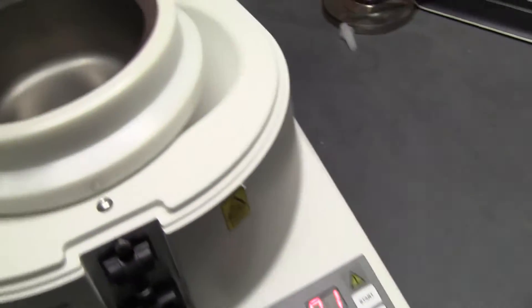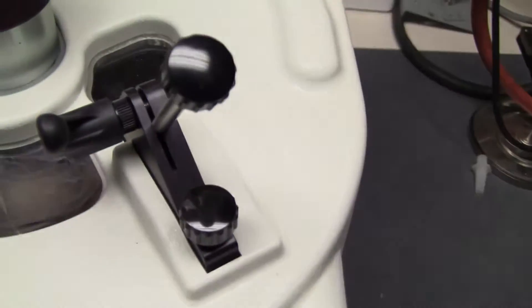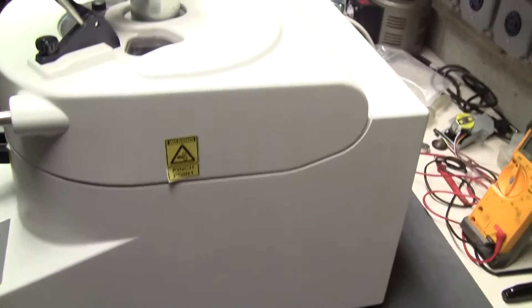I'm actually going to lower it from here. There's that handle up there. Adjustment blade. Pestle down. Very nice condition.